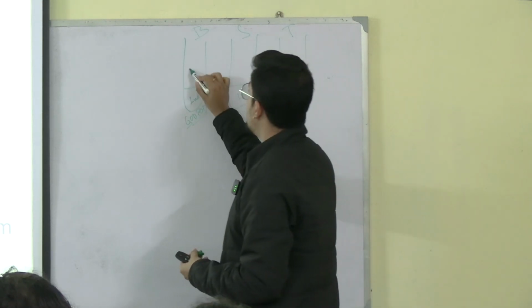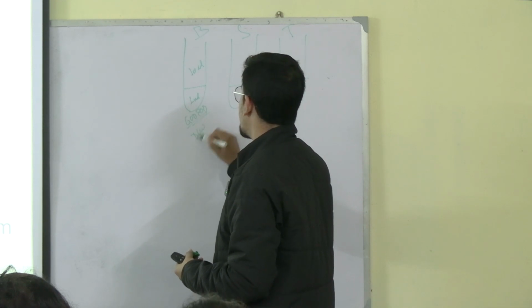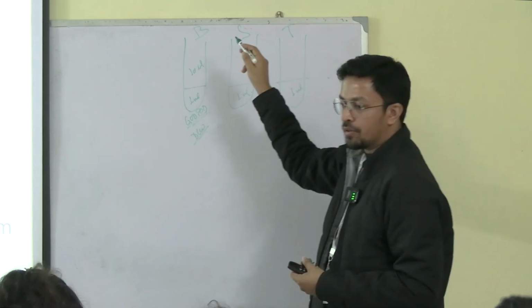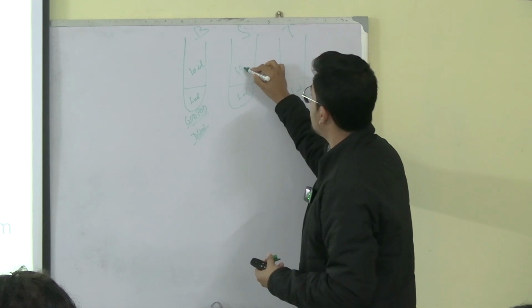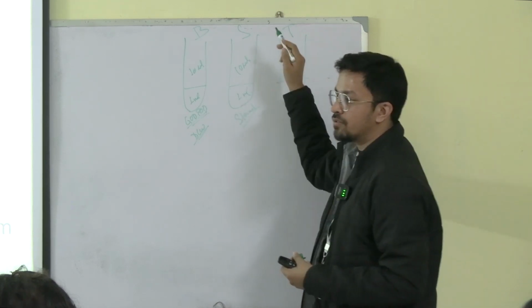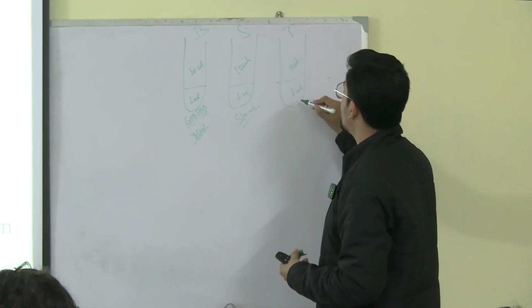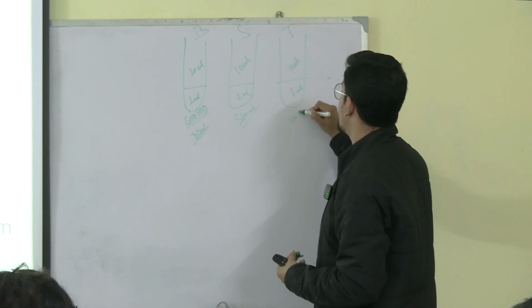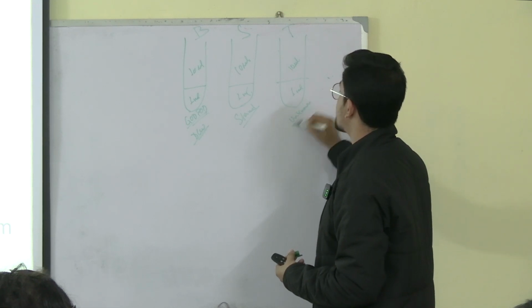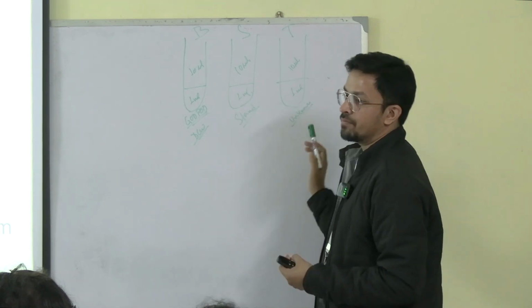In the blank we will add 10 microliter of distilled water, that is why it is known as blank. Over here we will add 10 microliter of the standard solution, that is why it is known as standard. And in test, we will add 10 microliter of unknown sample, the test serum. Now you will mix all of them.